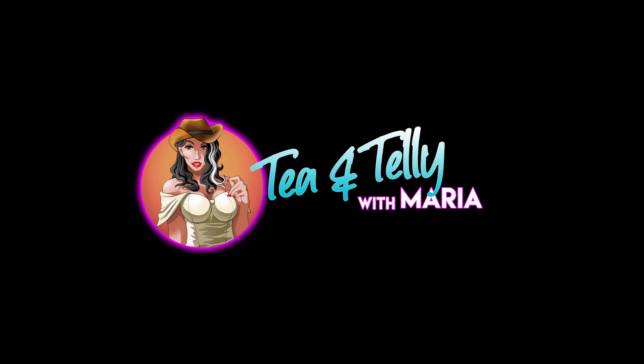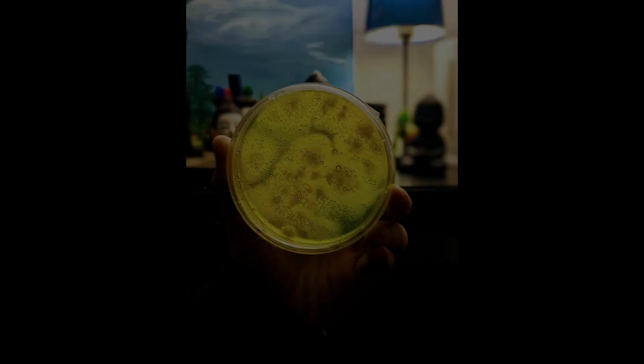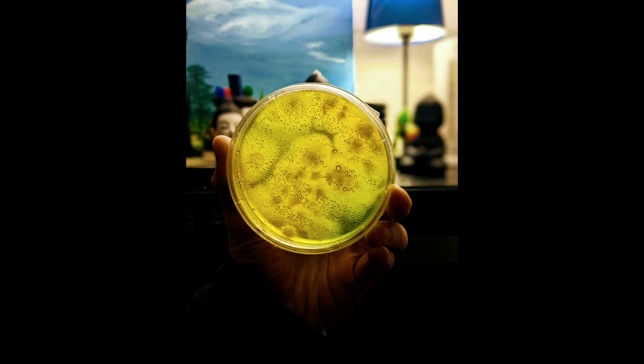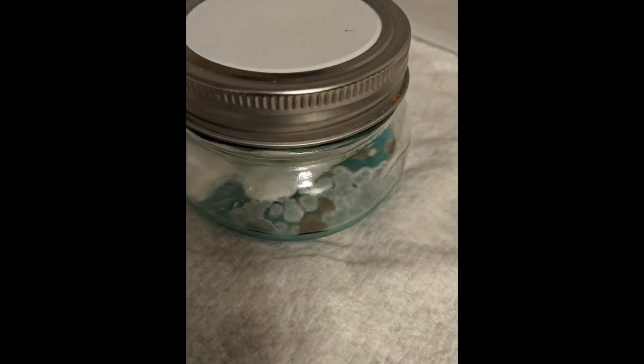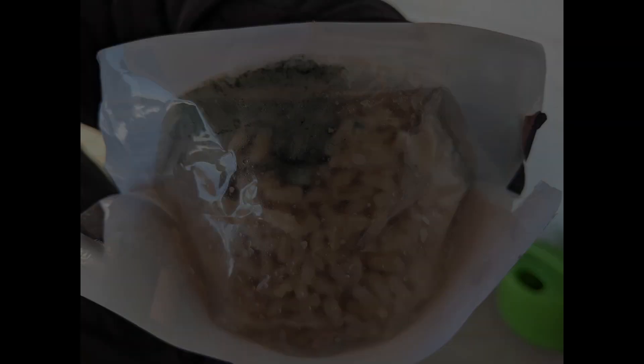What does contaminated mycelium look like? Here is some healthy mycelium in a petri dish, and next, contaminated. This is very contaminated. This is why it's important to disinfect and clean.